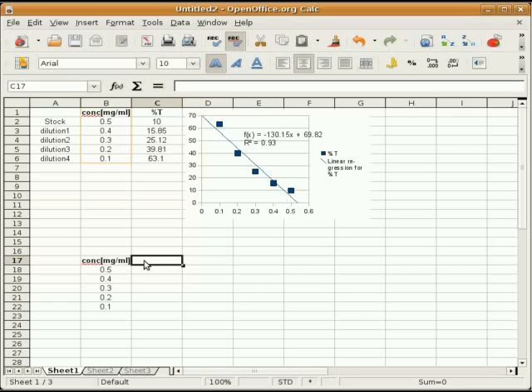So let's see an additional example. We are going to use the percentage of transmittance squared to see if we can find a better fit for our data. So we have our column of concentration that is going to be the same, and now we have the column of percentage of transmittance squared. To do that, we do the equation, we square the first value, and now we just fill out the column. This is done by the program automatically, so the program does it for you.